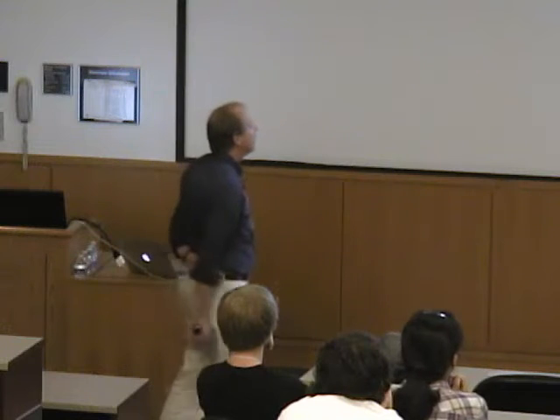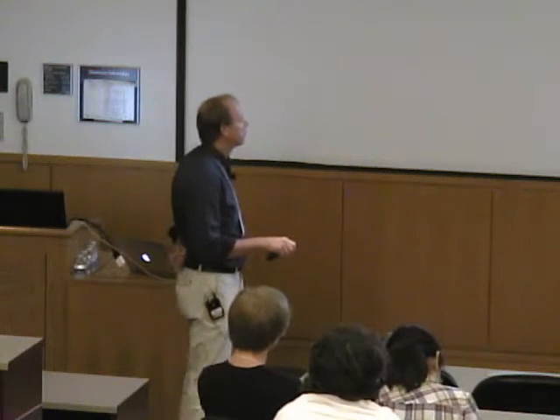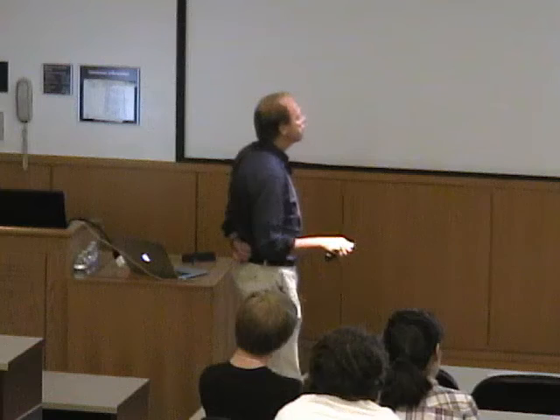So if we look at a transition metal now, for example an ion with spin 3/2, then at 0 magnetic field we get a splitting of the levels into the plus minus 3/2 levels and plus minus 1/2. This separation can be on the order of several wave numbers, whereas the interaction with the magnetic field in an X-band spectrometer is on the order of 0.3 wave numbers.